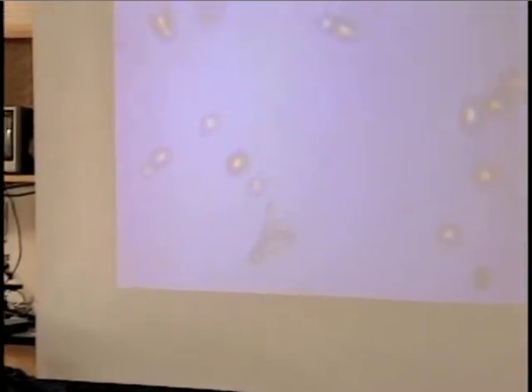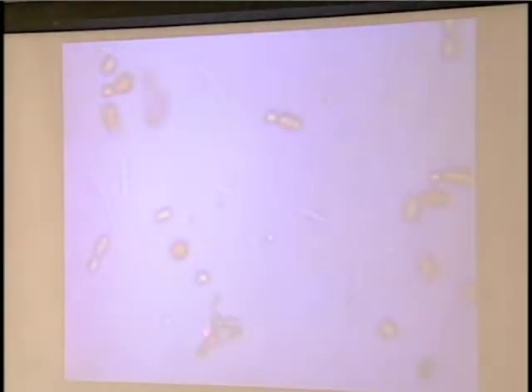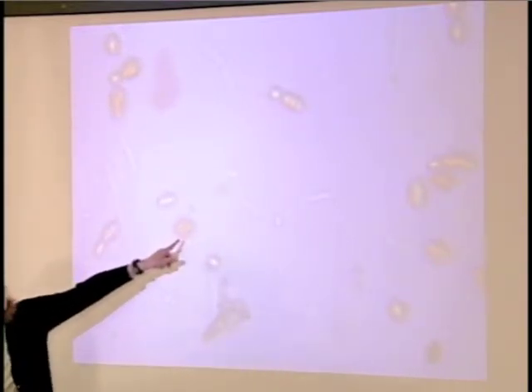What do we see? You get your little laser up there, guys. Okay, we know what color we're looking for here. What's the color? Aha. And now point out to us a bacillus. Where's the bacillus? Anybody tell me? Where's the bacillus on the screen? Yeah, they're rods. Look at, see? And they're prokaryotic. That's what you told us. These cells are what? Eukaryotic. Is there a size difference? Yeah. Oh, yeah, big size difference, which is one of the differences. Because remember, these cells don't have a true nucleus, where here you do.